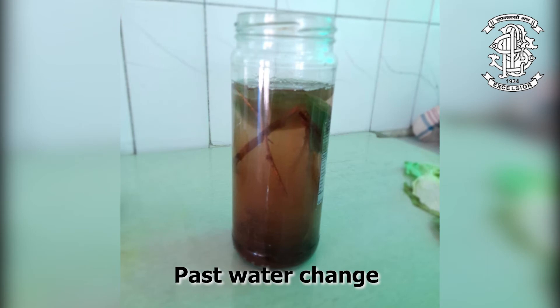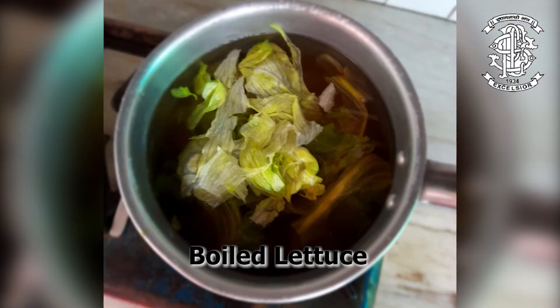While it was boiling, I took my sample that I'd prepared a week before, which included past water change from my aquarium, soil, reed, wood, and leaves that were fresh as well as wilted. Let's call this sample number 2.